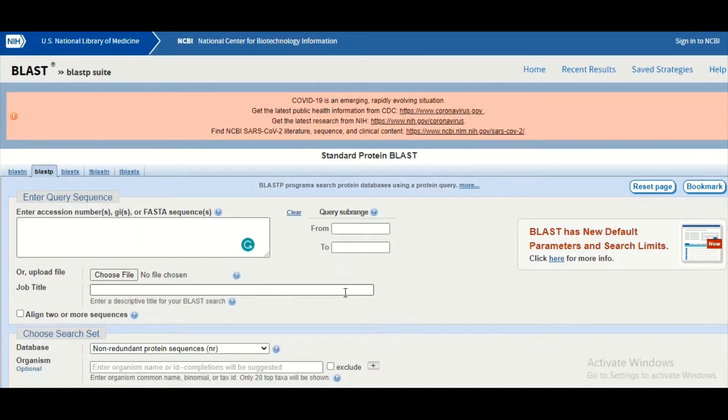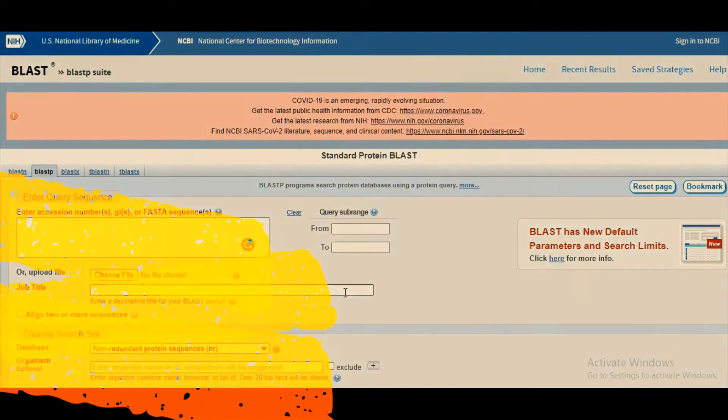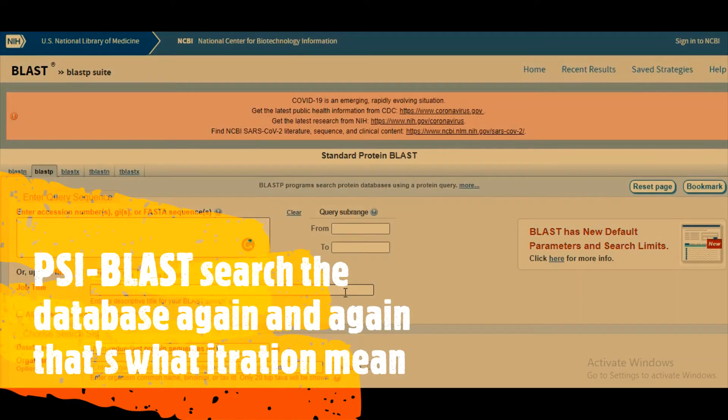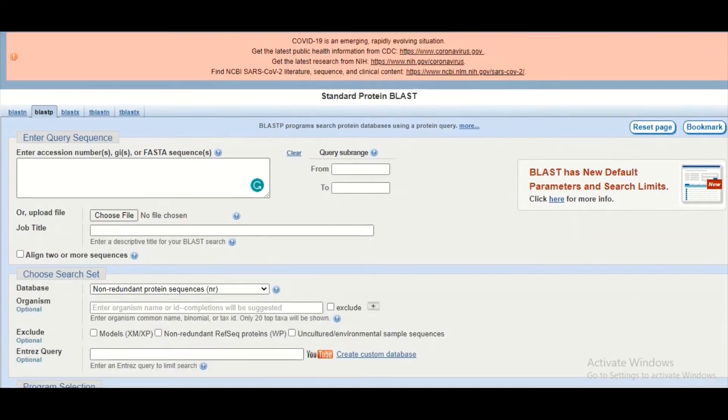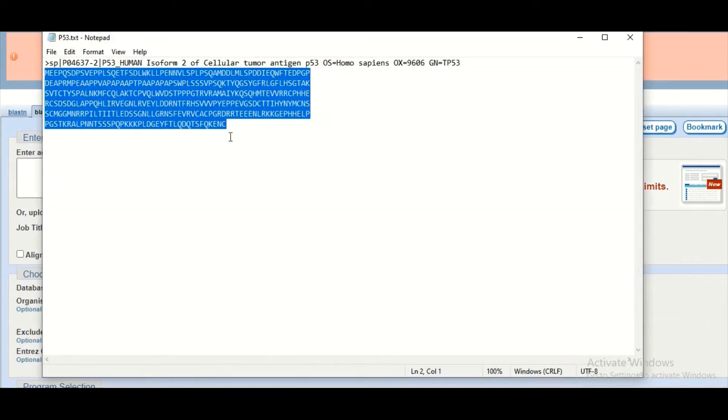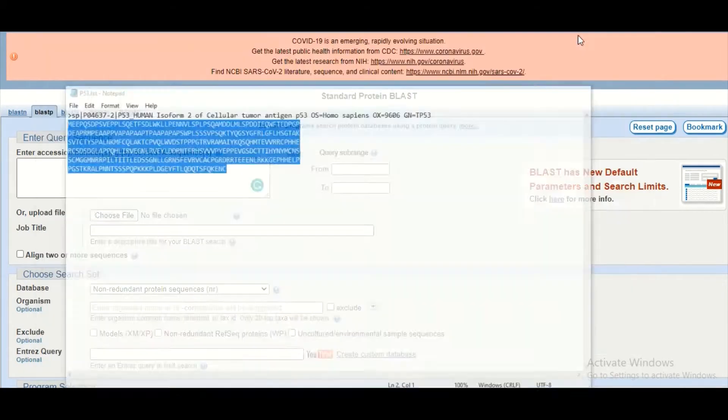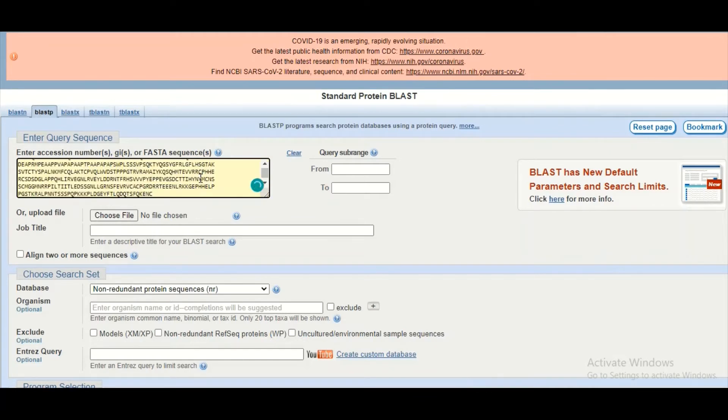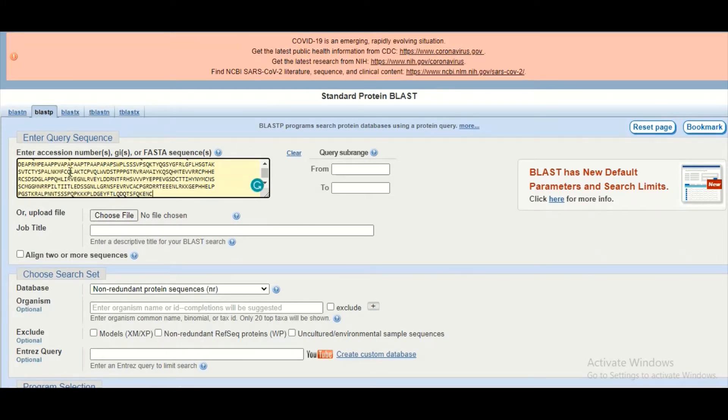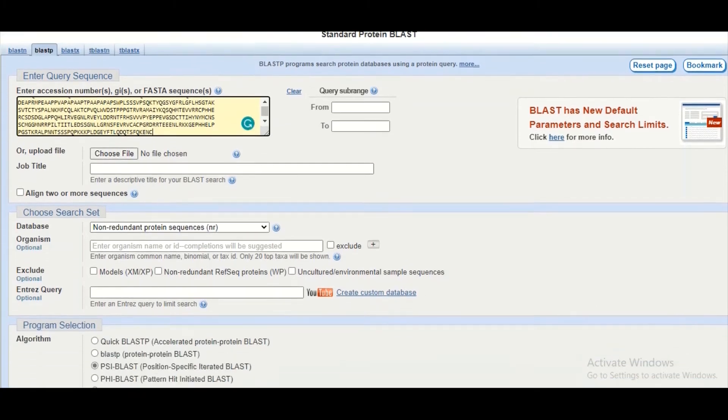To perform the PSI-BLAST, we are going to submit our protein sequence as a query to search in a database. So we will copy and paste our query protein sequence here in this box. Then we will move further down.